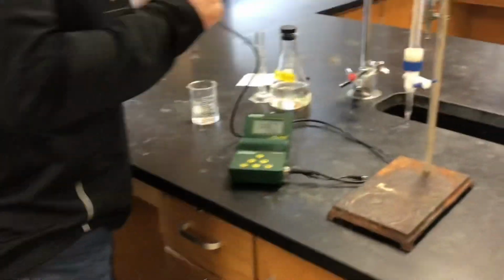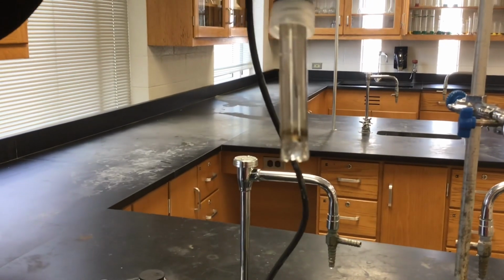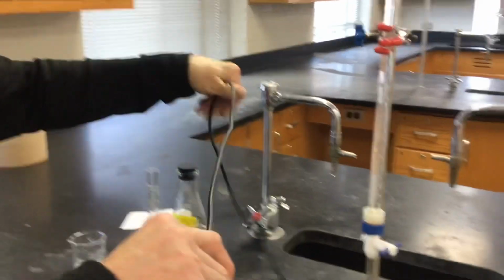So a pH meter has a little glass electrode. It's probably kind of hard to see. That's what's actually helping us record the pH.